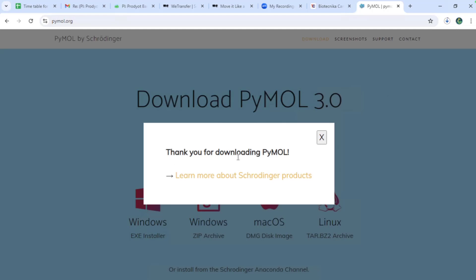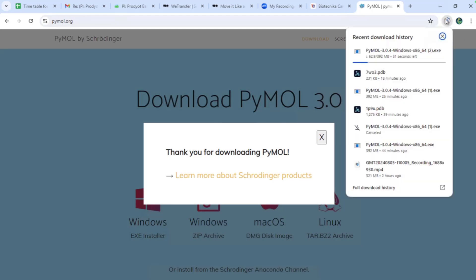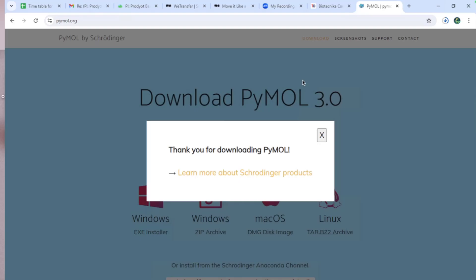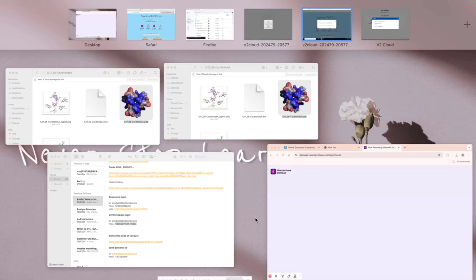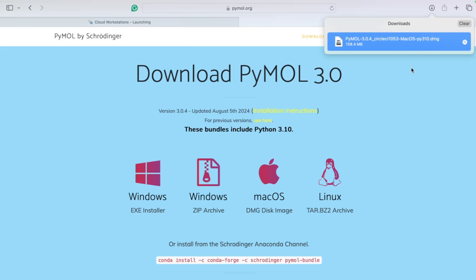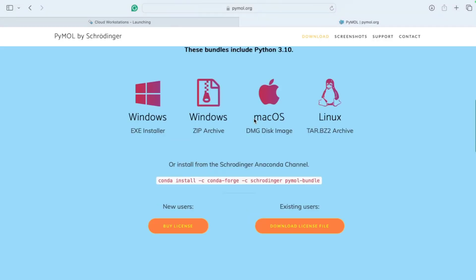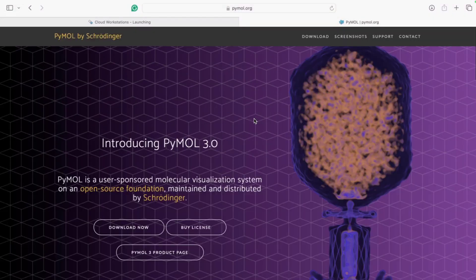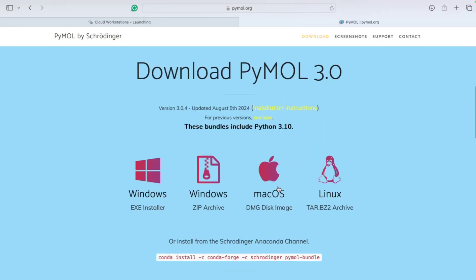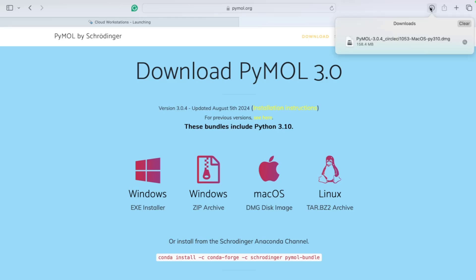Since we're on Windows, I'll click on the Windows option. It says 'Thank you for downloading PyMOL', so the download has started. Once the download is underway, let's move on to the Mac system and do the same thing. You type in PyMOL, the same page opens, and you click on macOS.